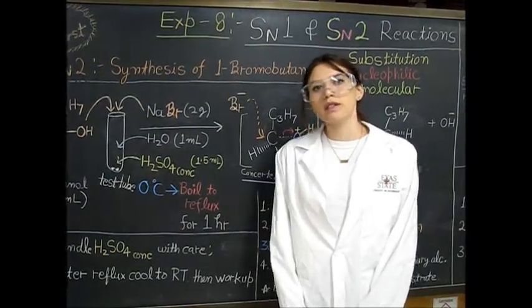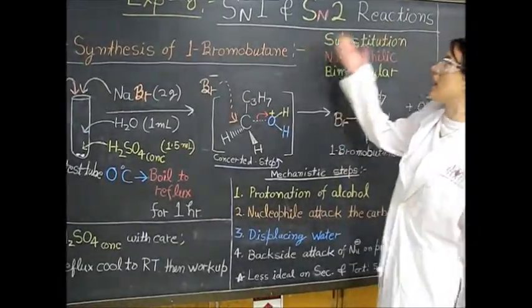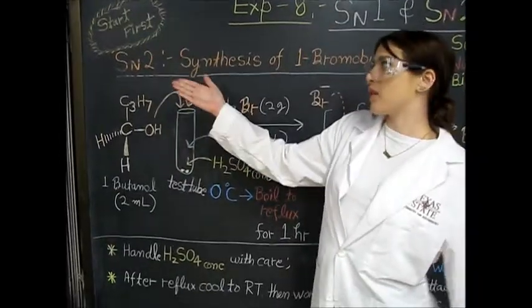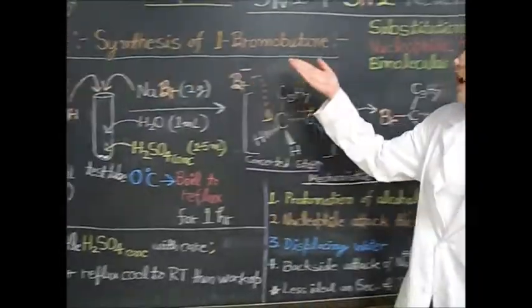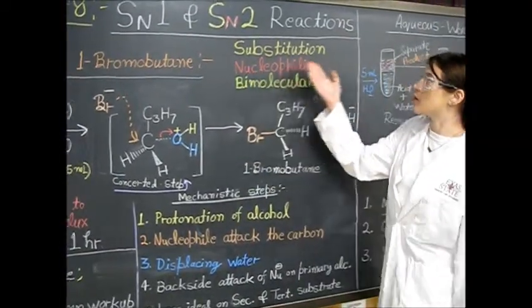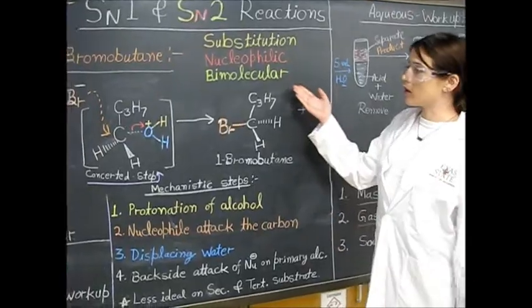In this video, we will be discussing Experiment 8, SN1 and SN2 reactions. The first part of the experiment we will be starting with is SN2, the synthesis of 1-bromobutane. SN2, as a reminder, just stands for substitution nucleophilic bimolecular.